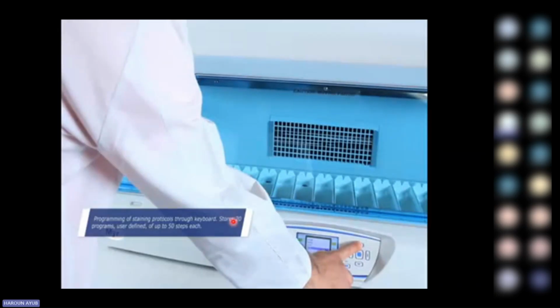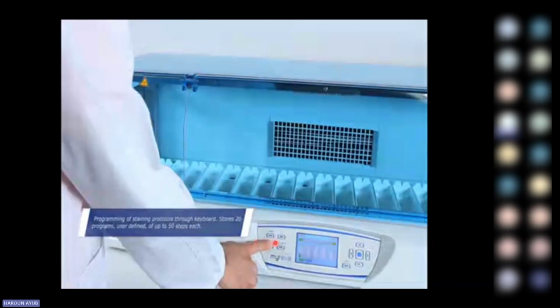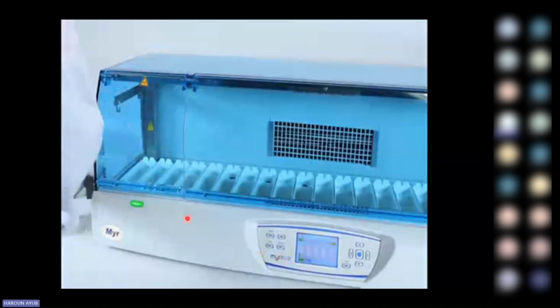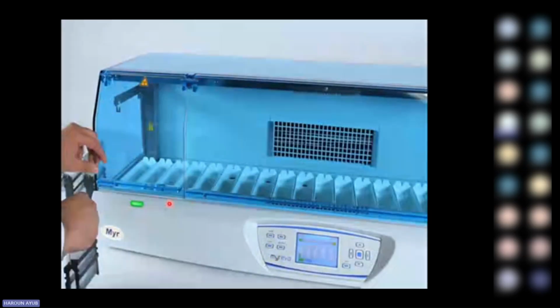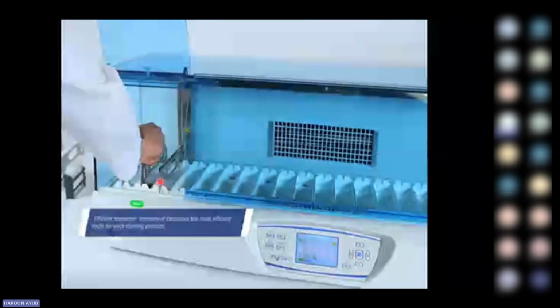So we can store up to 20 programs with up to 50 steps in each. So once you set up your program, you load it. This is the indicator. You have 2 loading stations, so you can have load station 1, station 2, and so on. And then you can interchange as it moves. You can interchange and continuously load or continuously feed.